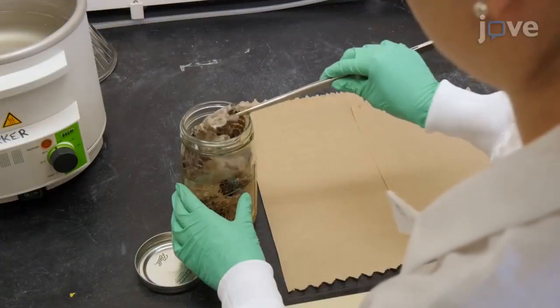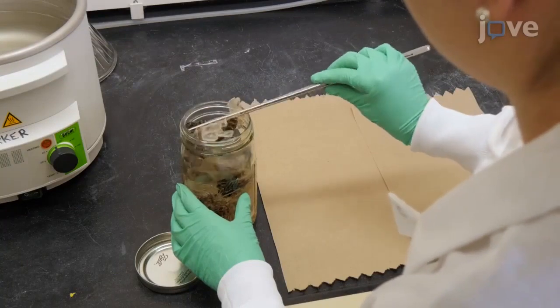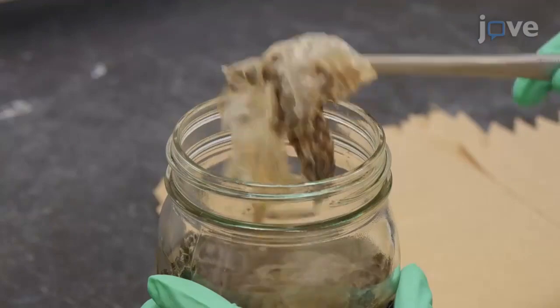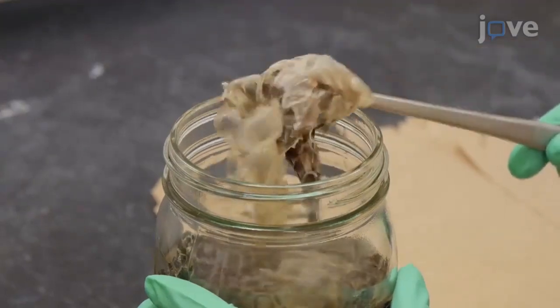The next day, use clean metal forceps to remove the shed pieces, shaking the pieces as they are captured to retain any remaining hexane within the container.